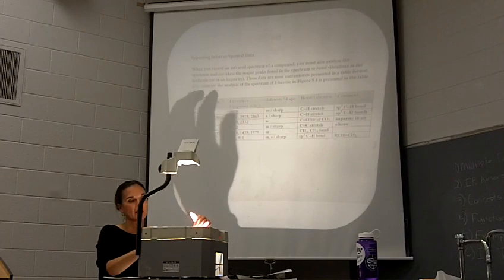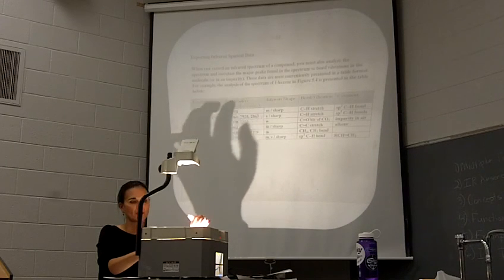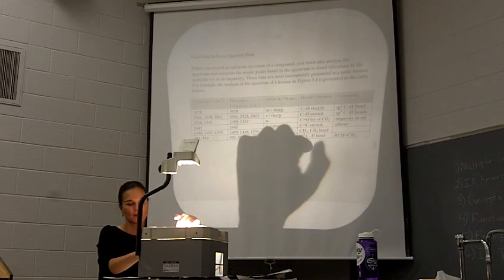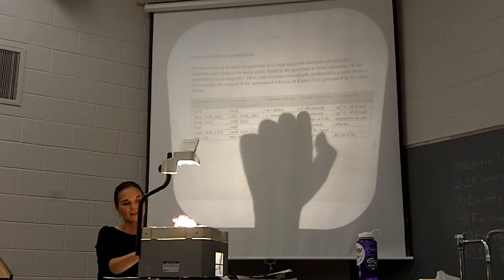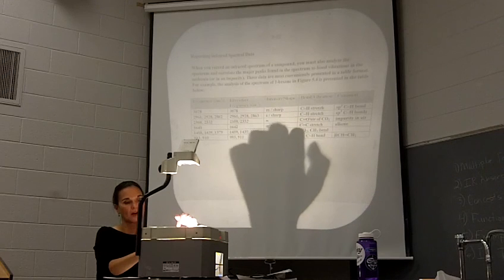So you want to give a list of the frequencies of the peaks that are present in that spectrum. If you have a literature spectrum to compare to, which in experiment 6 you do, you will list the literature frequencies, give the intensity, the shape, what bond or vibration it corresponds to, and then comment on differentiating it too. So like the CH stretch, there's multiple CH stretches. There's sp2 CH stretches that are usually in alkenes, or sp3 CH stretches that are part of alkanes.